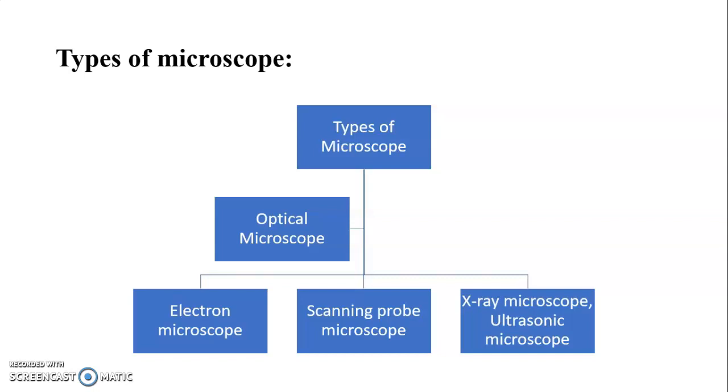At the top there is a basic part of the microscope, that is the source of electrons, the electron gun. A condensing coil is used to condense the electron beam, and the scanning coil is arranged in between the condensing coil and the specimen. The electron detector is used to collect the secondary electrons scattered from the specimen.